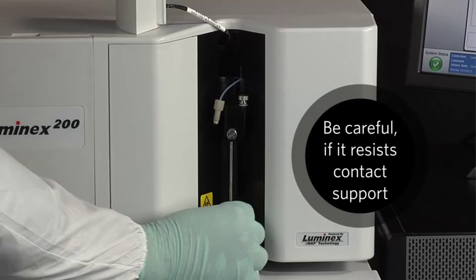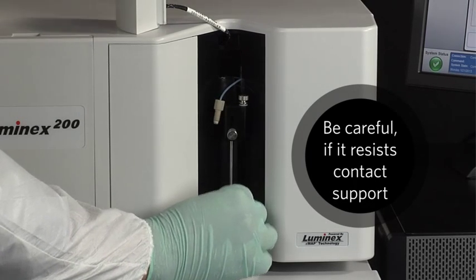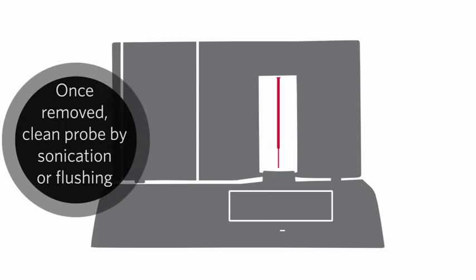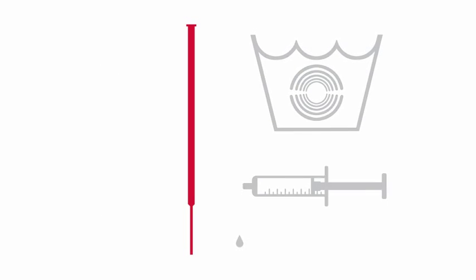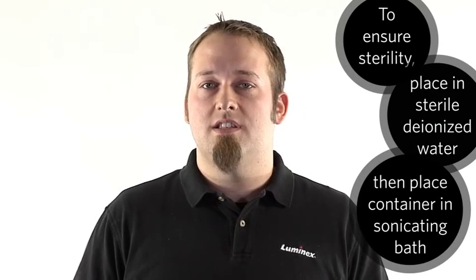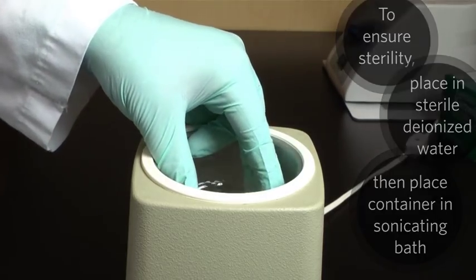Be careful not to damage the sample probe — it should slide out easily. If you feel resistance when trying to remove the sample probe, contact Luminex technical support. Once the probe has been removed from the instrument, it needs to be cleaned by either sonication or flushing. To ensure a sterile environment for the probe, a good tip is to place the probe in an upright cylinder filled with sterile deionized water and then place the cylinder into the sonicating bath.